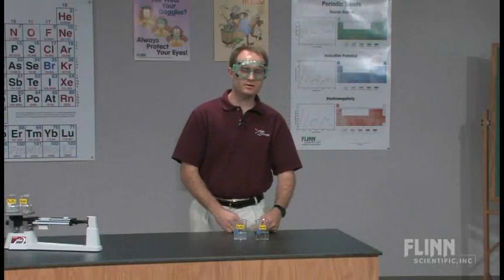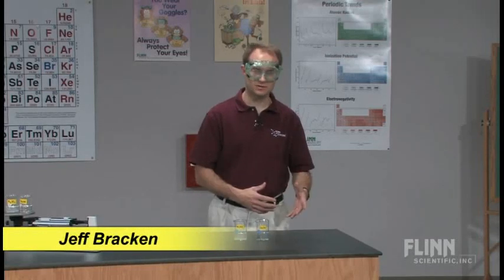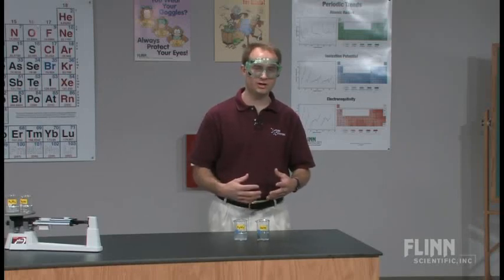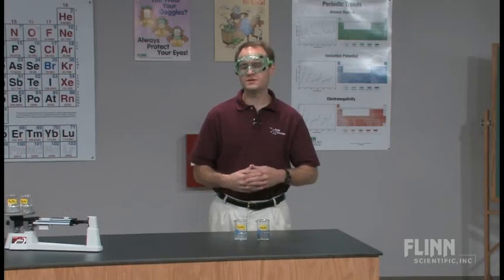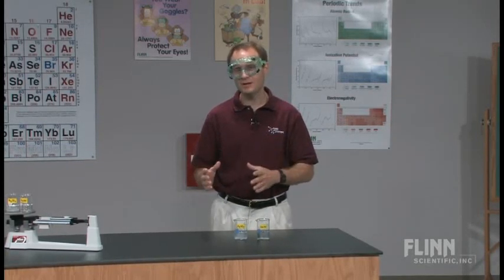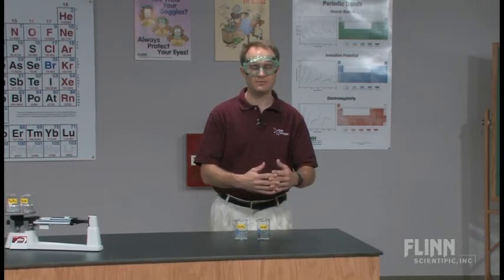Each year when we start the matter unit, I enjoy teaching about chemical change and physical change, and we talk about evidence. How do we know if a chemical change or a physical change has occurred? This is a nice demonstration. Once the students have the basic idea as to knowing the difference between a chemical and physical change, really applying that and then going a step further.